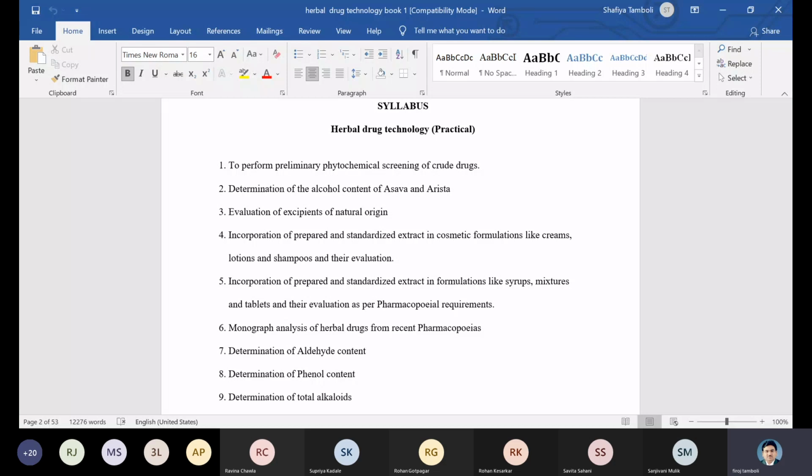Now here, what is common? Here common is you use the same plant material, but what is different? You use different solvent material. So by using solvents polarity-wise, with a single plant material, that is called successive solvent extraction. And that will help in the isolation of secondary metabolites present in it. It is a very easy process to isolate later on.